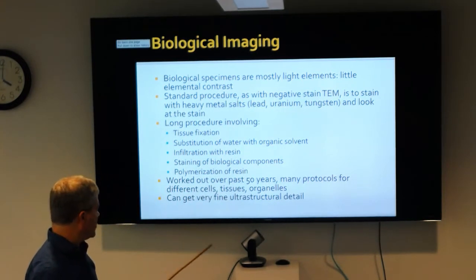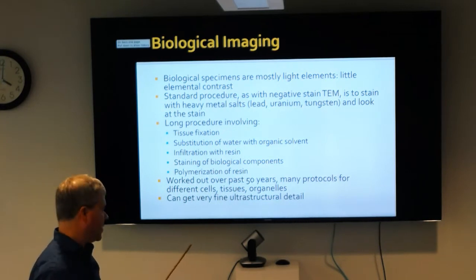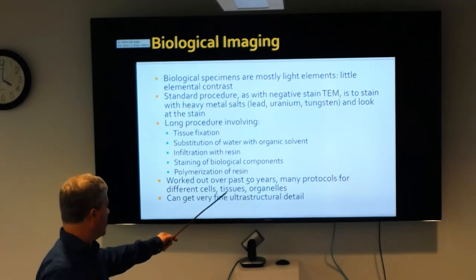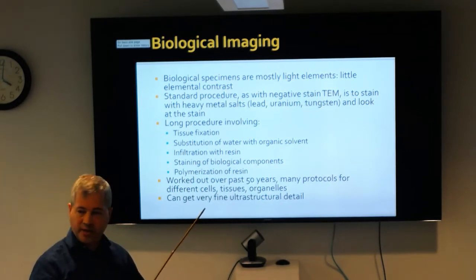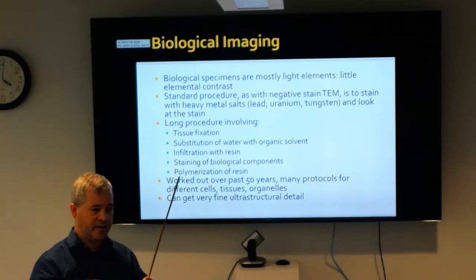It went out of fashion for a while, but with the FIB-SEM it has come back into fashion in the past 10 or 15 years or so. There are many protocols worked out for different cells, tissues, and organelles, depending on what you want to enhance. Some protocols, if you're really looking for mitochondria, will expand the mitochondria before they're stained, so that you can see the cristae and all the fine details.